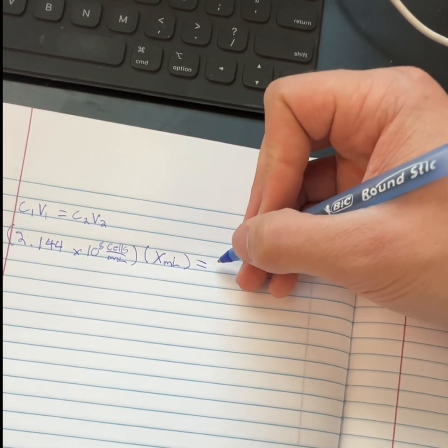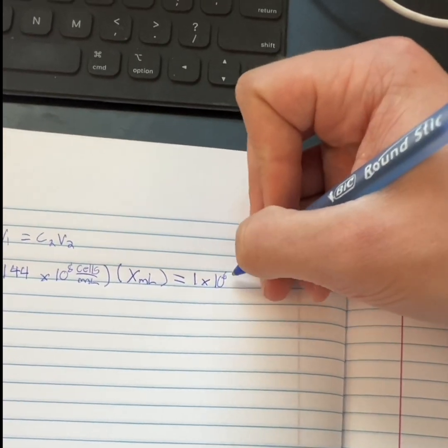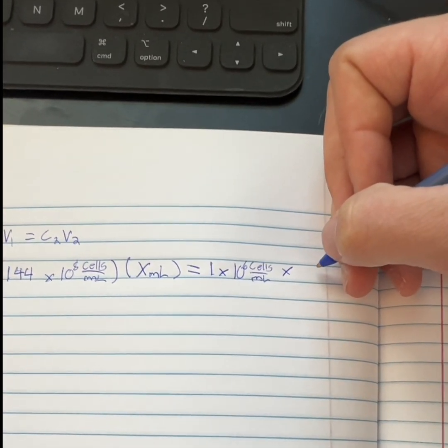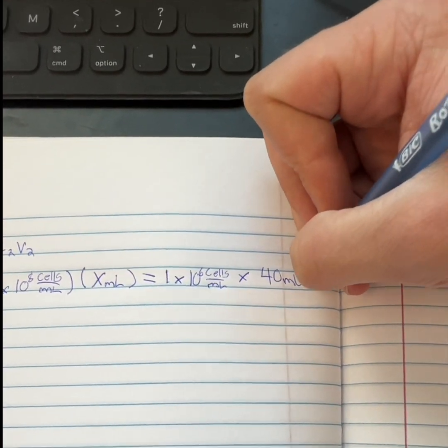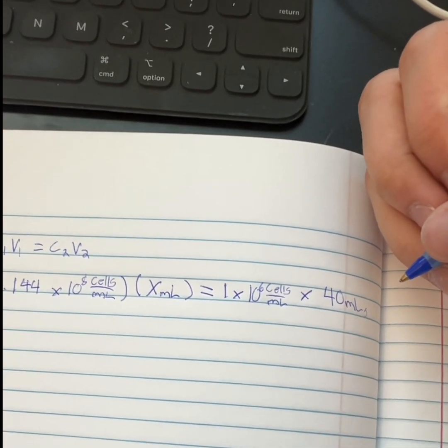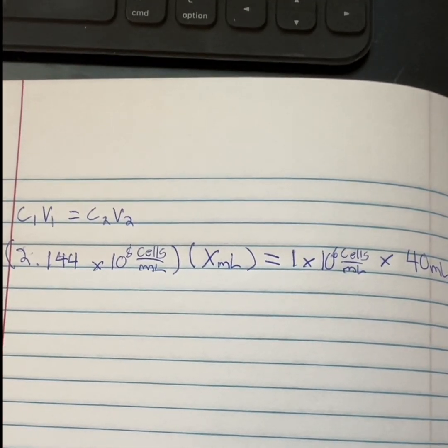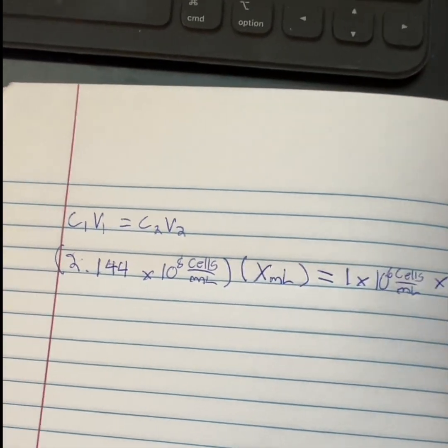And then this is going to equal our target concentration, 1 times 10 to the 6th cells per milliliter, times, we're doing 4 plates, so I'm going to make 40 milliliters because it is 100 microliters per well, 96 wells. We're not using the negative control lane, so it's going to be even less than that, and we want some extra because you're always going to have some of the volume lost to residual liquid on the boat or in the tube.